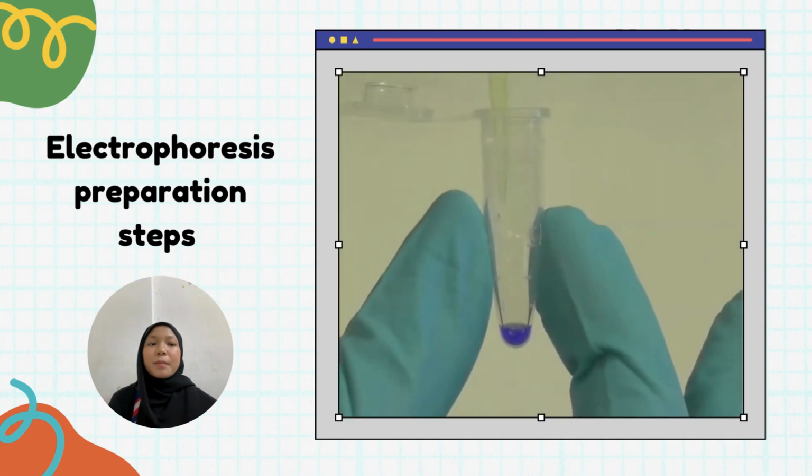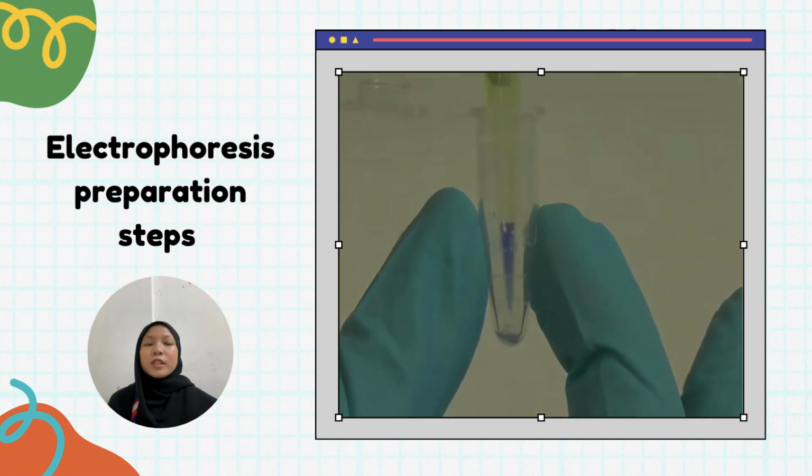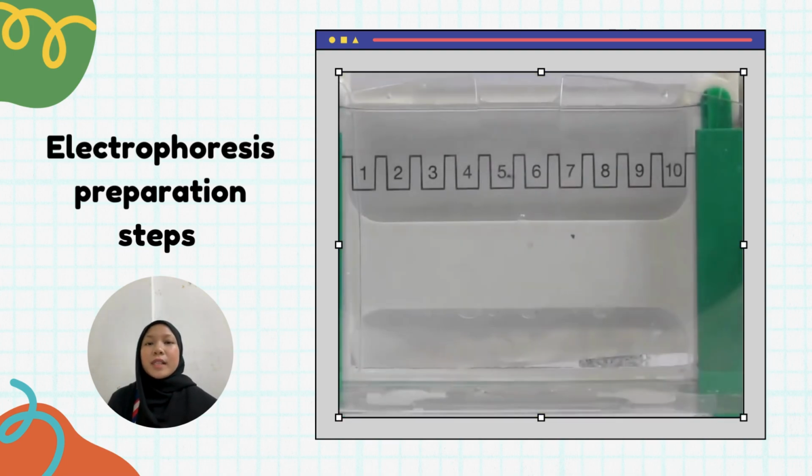Samples that are badly prepared, containing air bubbles, will cause insufficient sample to be loaded, while samples that are loaded very quickly will spill out from the well and will also result in insufficient sample being loaded.